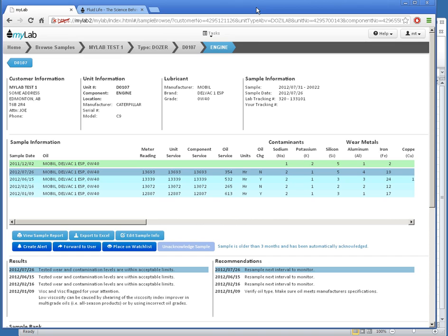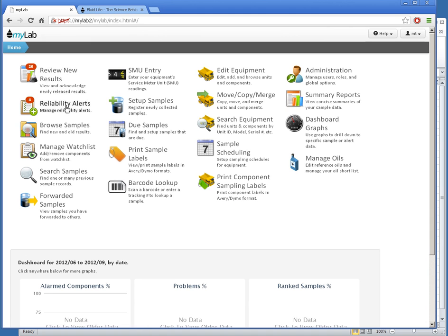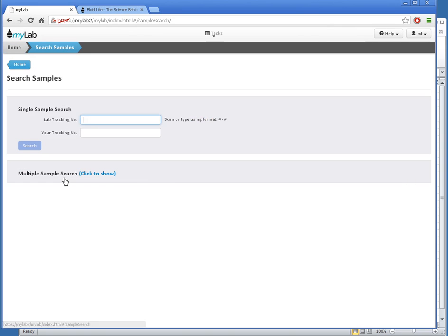I could have picked any method to get to the results, such as equipment search or review new results as well. To export results from multiple components at the same time, I'll go to the Search Samples task. I'll now click the Multiple Samples search here.